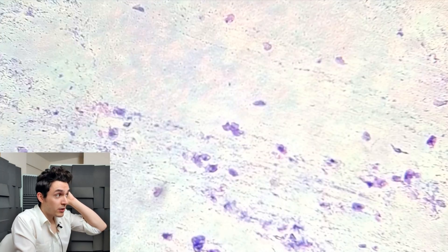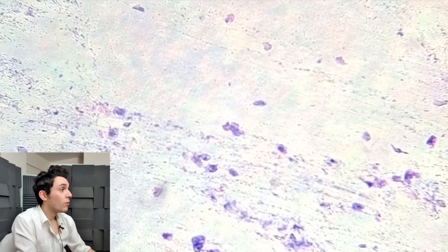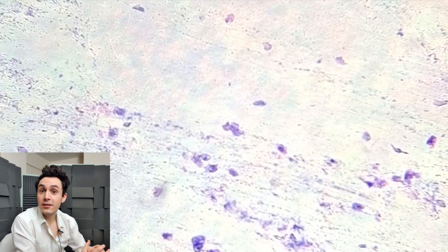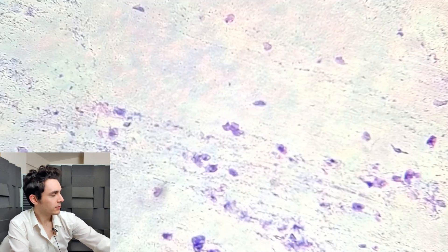I've applied a special combination of dyes — what we call Giemsa stain or Giemsa solution — which is a combination of three separate dyes. That allows us to see the nucleus inside of cells, which is important if we want to identify white blood cells, which is what I'm hoping to see here.